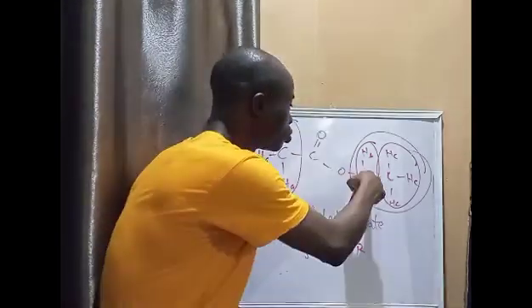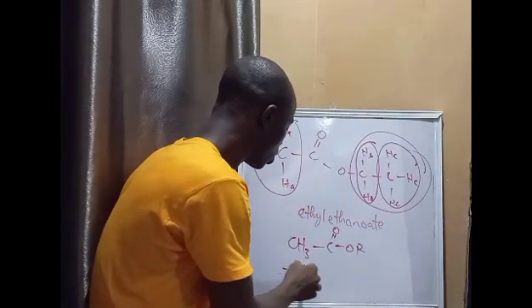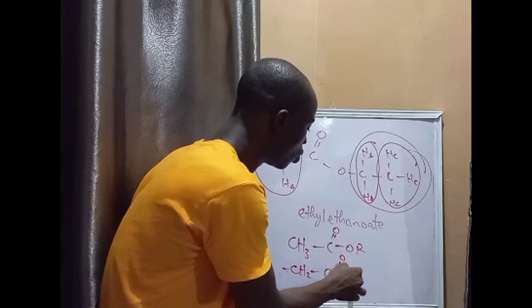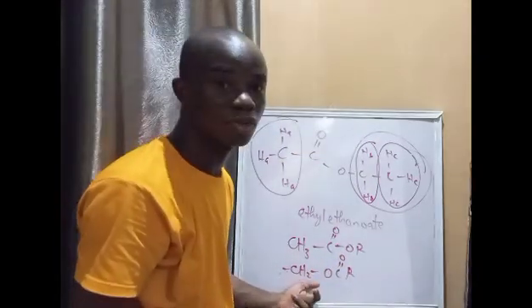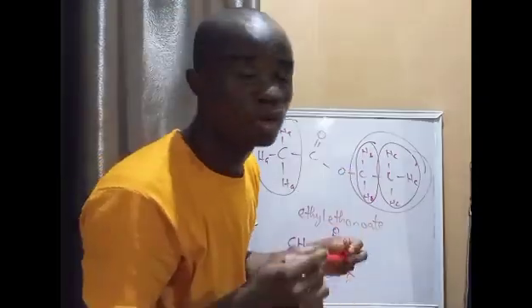At the same time, you want to read for this, you look for where you have CH2 and you have OC double bond O and you have R. So you look for the chemical shift of these two protons, and that's how you get the chemical shift from the table of values.